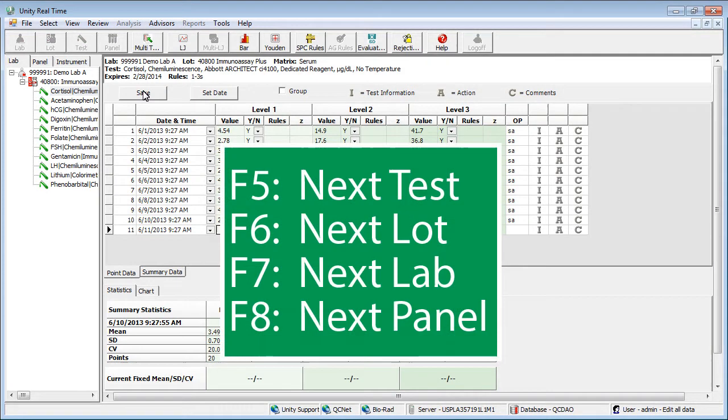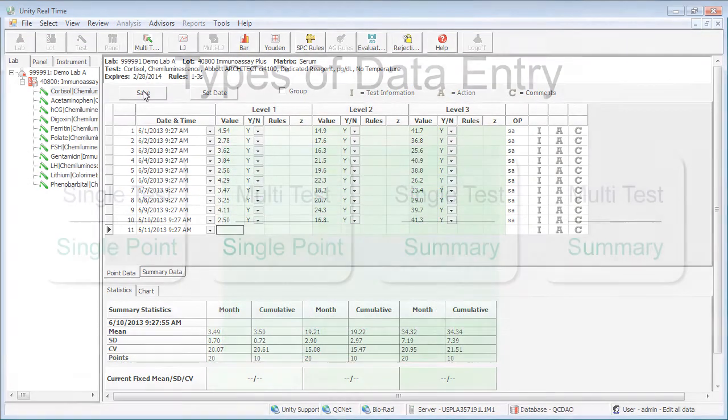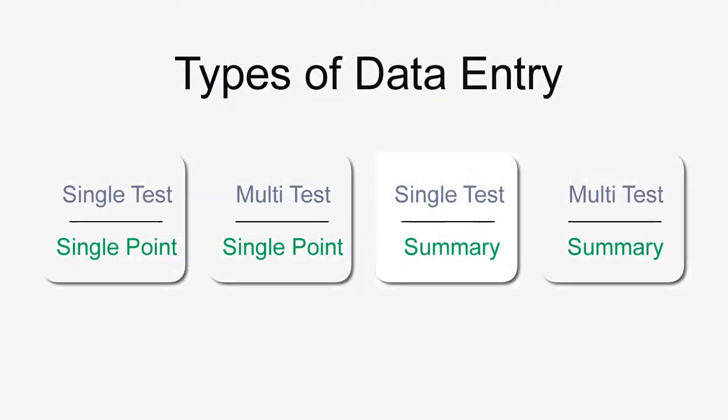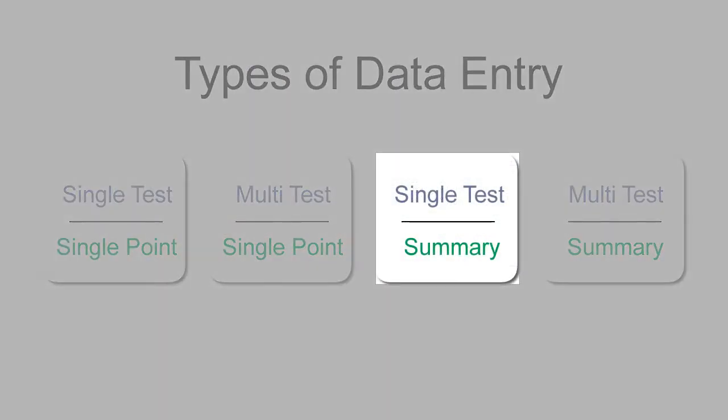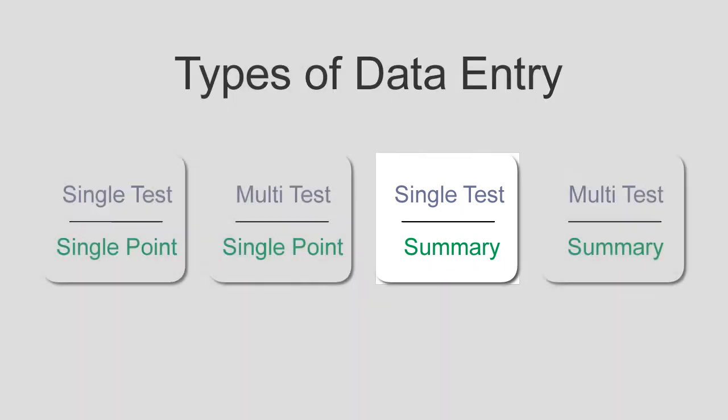You can use the function keys to move to the next item. Let's take a look at the next possible data entry method by returning to the screen where we left off.